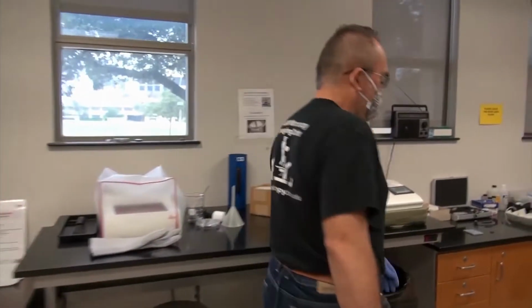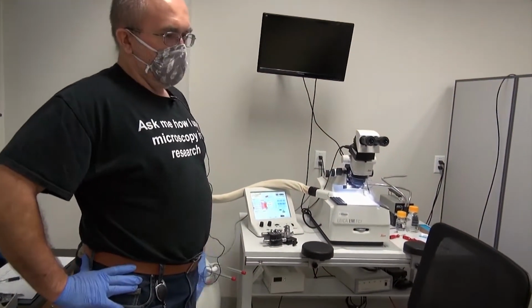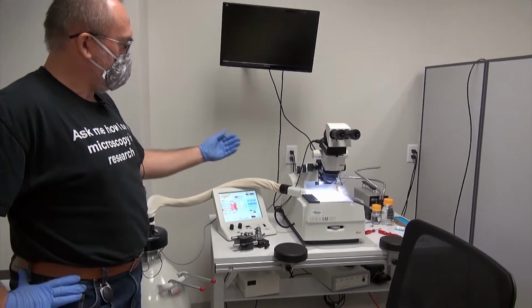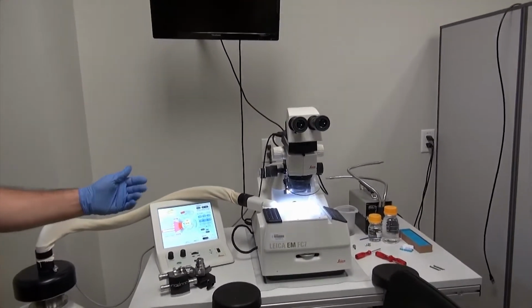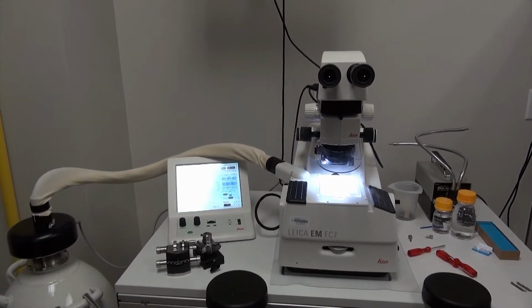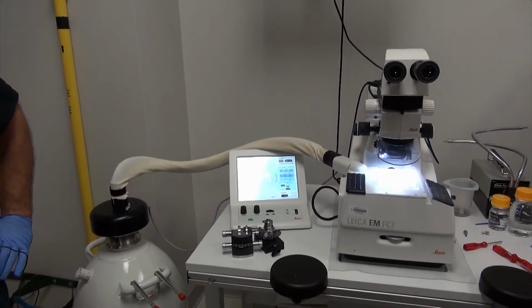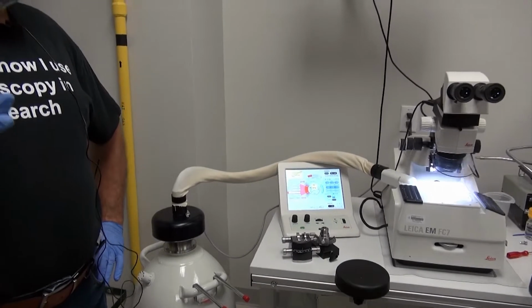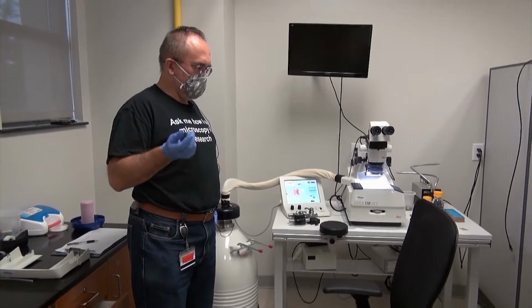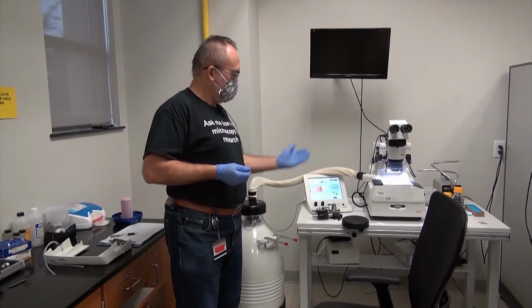Speaking of sectioning, this is our Leica EM UC7 ultramicrotome, and you can actually currently see that it is equipped at this moment for cryosectioning. So we can section traditional samples that are embedded in resin and polymerized, but also samples that are either soft polymers that normally are very difficult to cut at room temperature, or frozen or vitrified biological samples.